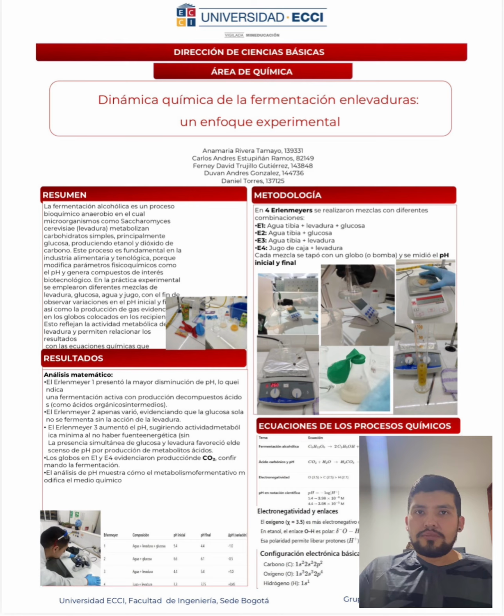In E2, the pH hardly changed. This makes sense because glucose alone cannot ferment without yeast to catalyze the reaction. In E3, the pH increased, likely since there was yeast but not glucose. The cells had almost no energy source, so their activity was minimal.